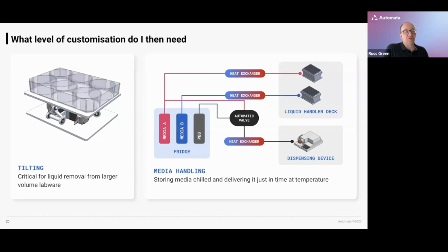Now, this is something where there are some commercially available tools for doing this, and often they're part of the larger liquid handler that we might integrate into a more holistic system. So this is a reasonably solved problem, but it is something we have to consider, and certainly as a slightly more bespoke piece of equipment that needs to be incorporated.